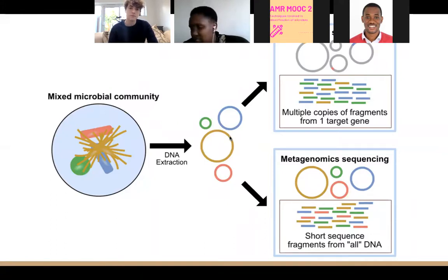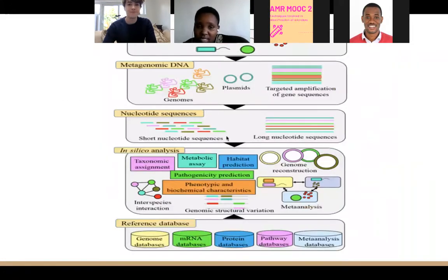And that is metagenomics. But when you do metagenomic sequencing, you have to be very good in analysis of data, because you get too many nucleotides, and you may not be very good in analysis. It is very good when you are targeting new species, because you don't have any reference to help you in designing the primers. So when you do metagenomics, you have a bigger chance of getting new species, but you must be very good in analyzing the results. You must be very good in informatics skills.